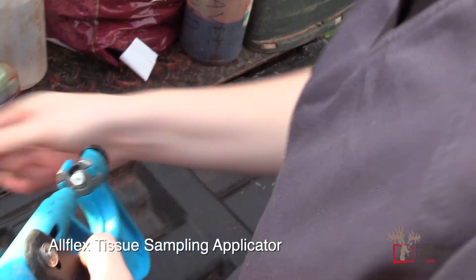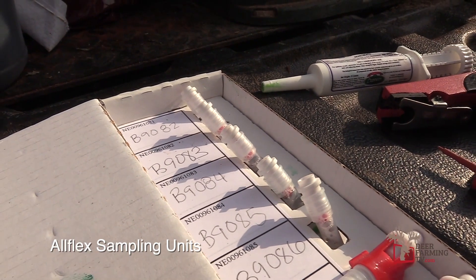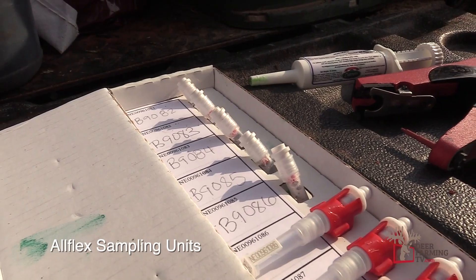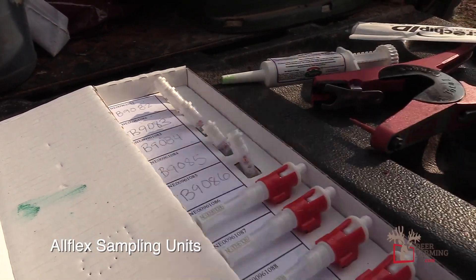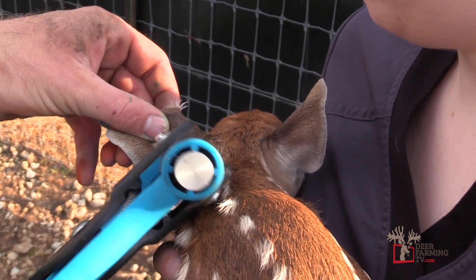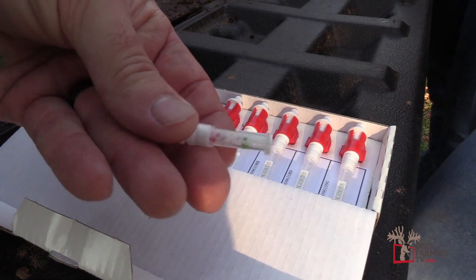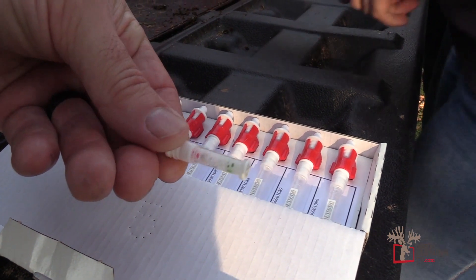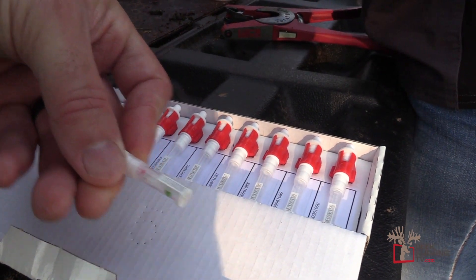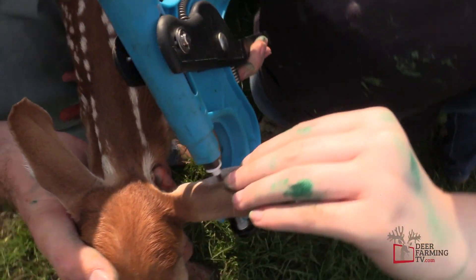How these tubes are labeled, you can write down your farm tag number or everything right there in the field, and it's really simple and easy to keep up with. So what's the cost in all of this? The applicator gun costs basically $50, and each tube costs $3. But when you send in your DNA to NADAR, NADAR will credit you that $3 per sample.